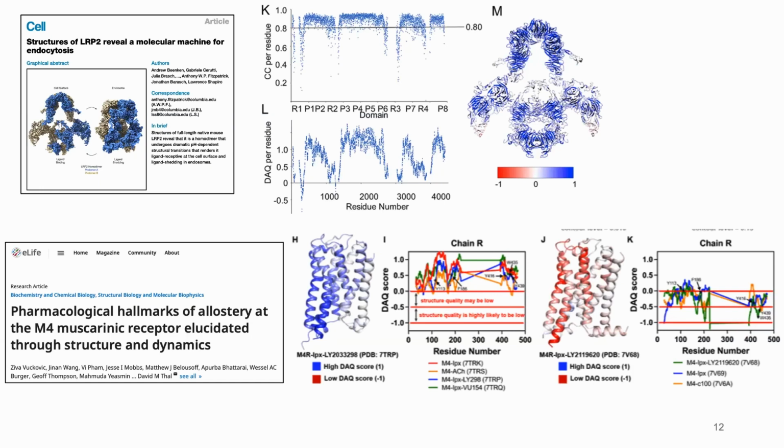Another point: what actually affects the DAQ score is the resolution band of 2.5 to 4.5 angstrom. We confirmed that up to 4.5 angstrom it works, but at 5, 6, or 7 angstrom resolution, it's hard.